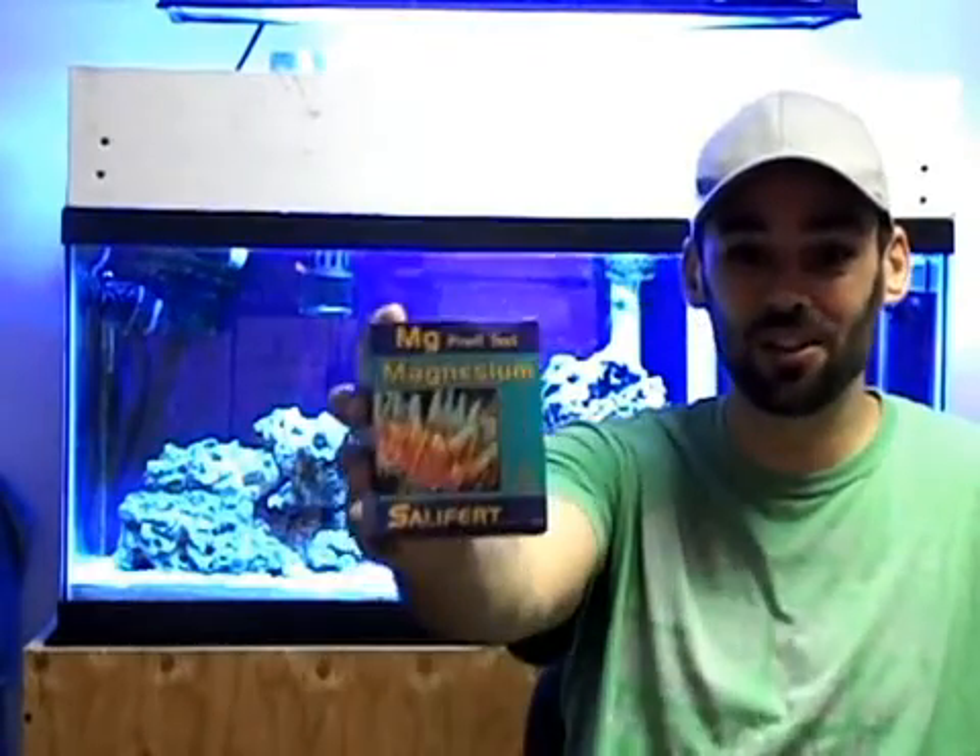Hi and welcome back to Bobby J's Reef Tank. Today I'm going to teach you how to use the Salifert Magnesium Test Kit for your saltwater aquarium.